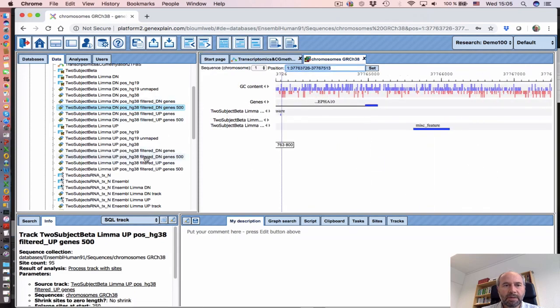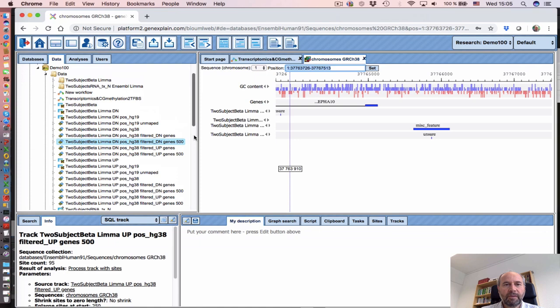And we see those up-methylated dinucleotides. So in this case, this gene, and it's extending the 5' area of this gene, and in that area, this particular region will be analyzed for transcription factor binding sites in the next workflow. So that's how we created and ran the workflow for the analysis of transcriptomics and DNA methylation data together.